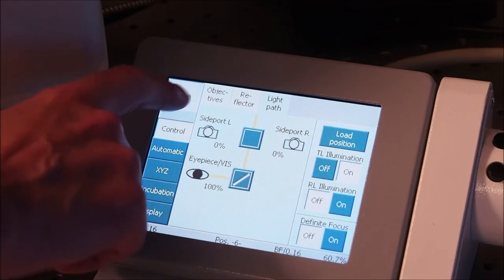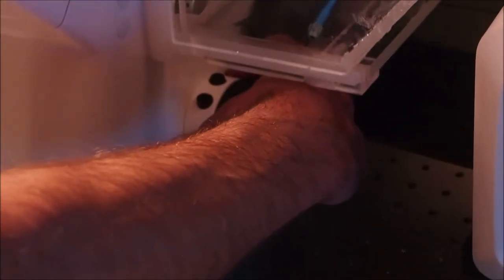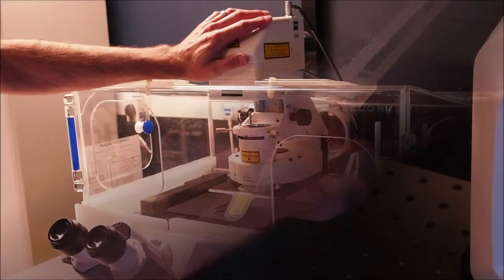Press the home tab again, and then on the right of the microscope, press the third button on the focus knob mount. It is a flat button towards the rear of the mount and removes the laser safety interlock.